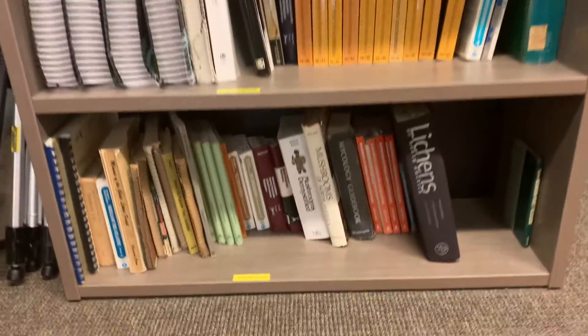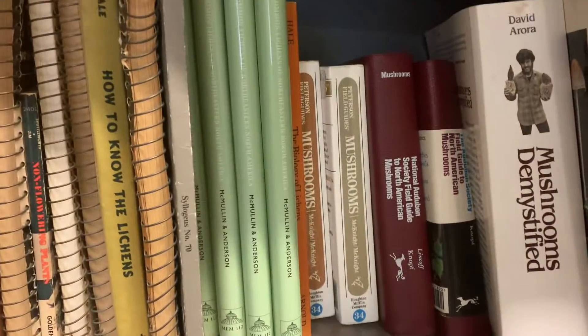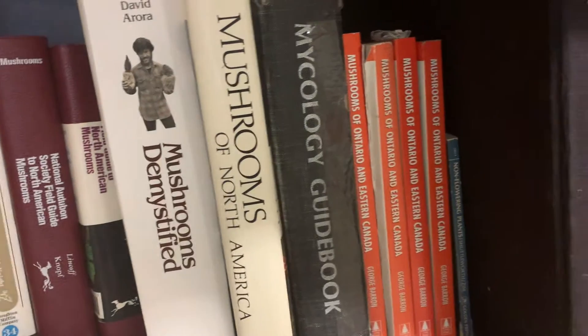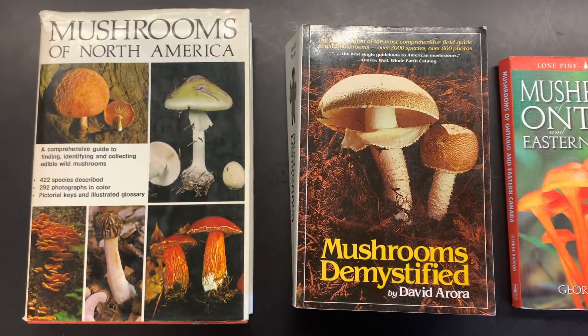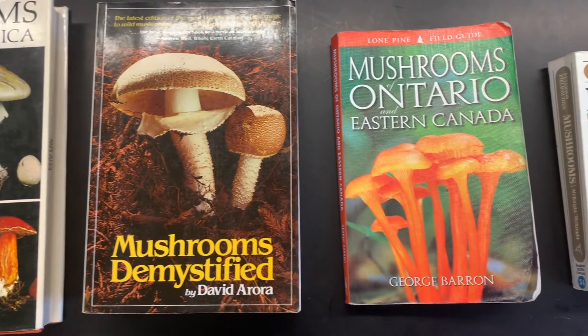At the Ecology Lab, we have various mushroom ID guides available for you to use. Some of these may list spore print color in the identification key or might include it as a characteristic in the information about the mushroom. Either way, spore prints are a very useful tool to help you in identifying your mushroom.